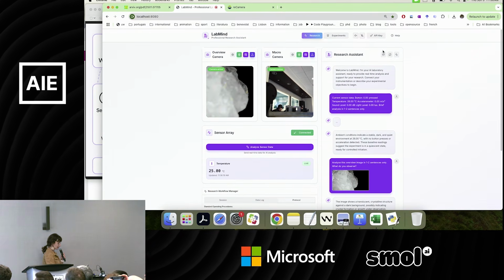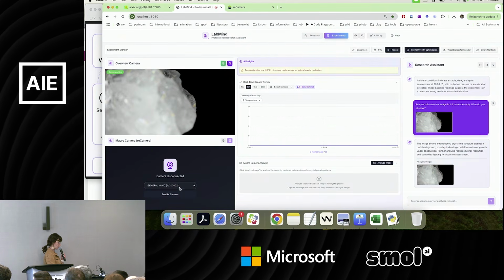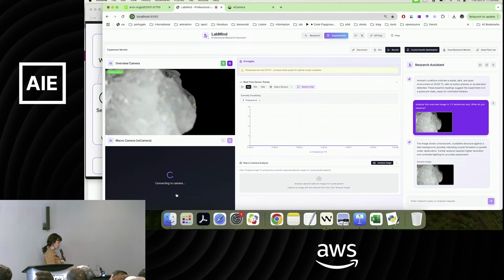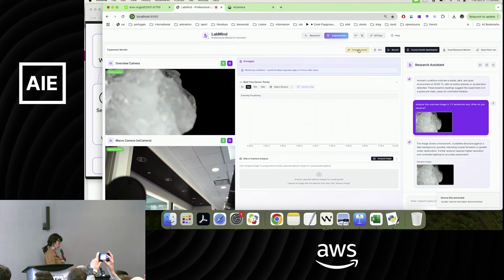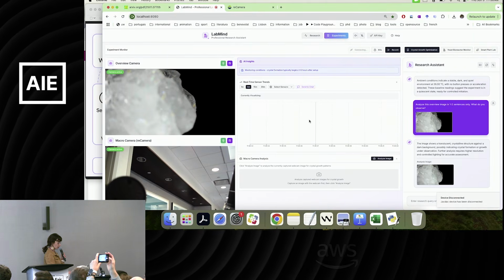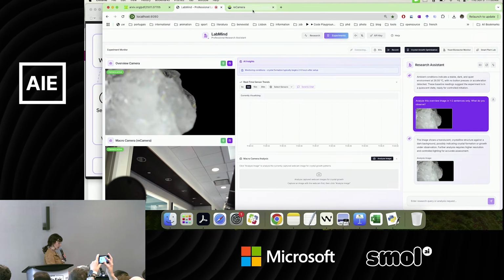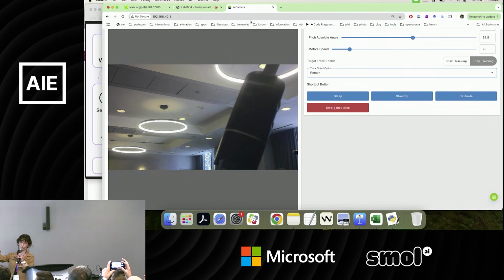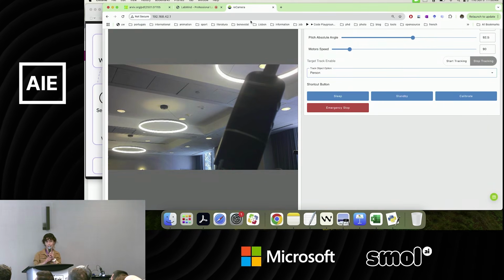And of course, if you are doing that experiment several times, you can go ahead and create a custom page for your experiment. And it will monitor the data from the, we're going to connect again the Jacdac. It's going to monitor and plot the data in real time. And the cool thing is also that if you want to leave your experiment running and go away, you could actually have cameras that are autonomous.